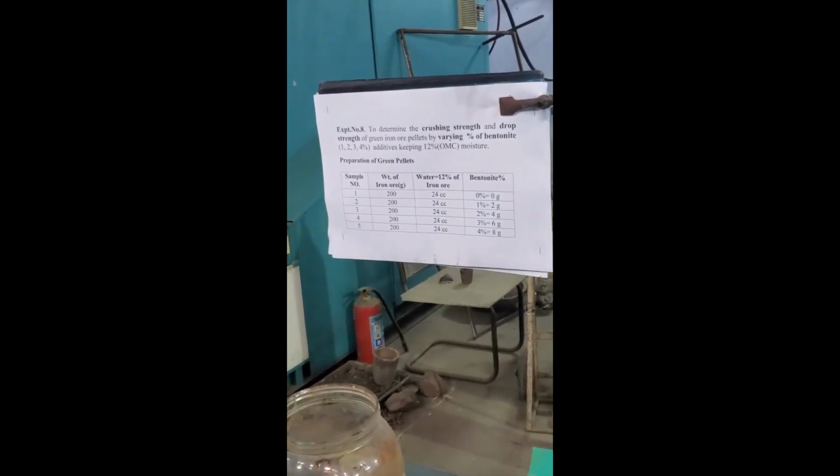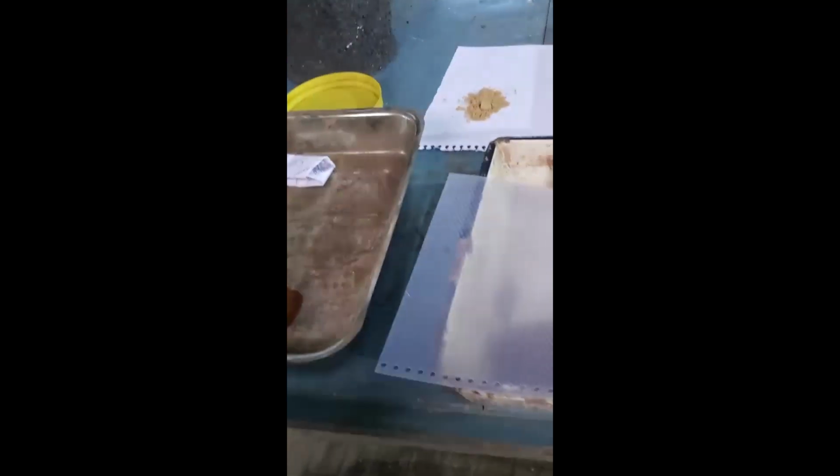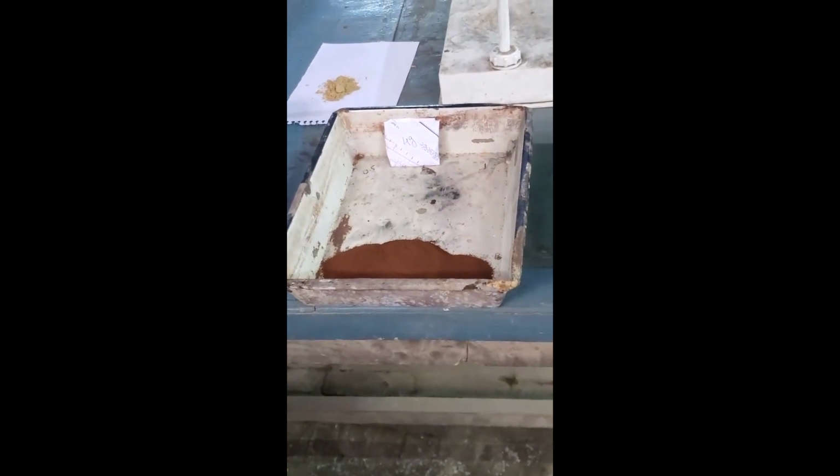We already told you there are 5 samples, so 5 trays are taken. This is the first tray, this is the second tray, this is the third tray, this is the fourth tray, and this is the fifth tray.